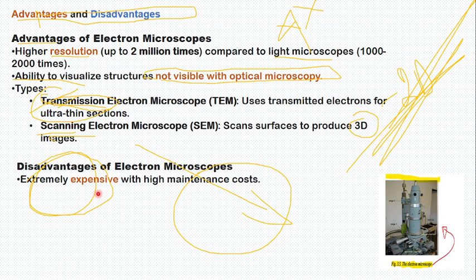It's because it is expensive. Not only that, it also needs elaborate sample preparation, meaning the sample to be analyzed is difficult to prepare.